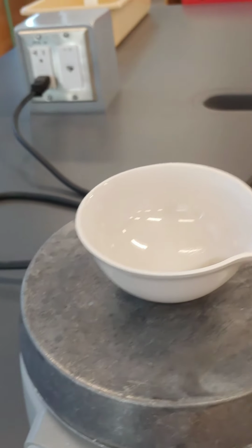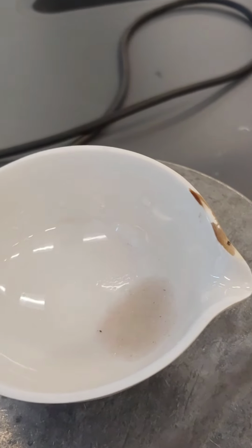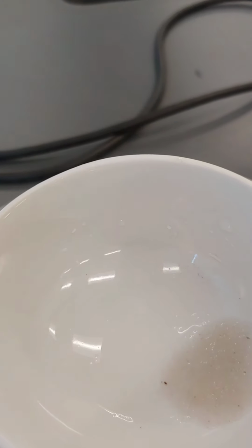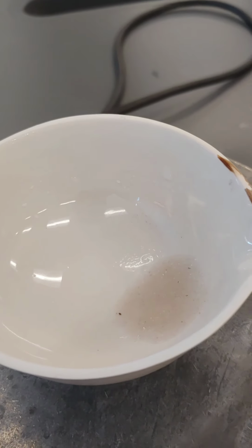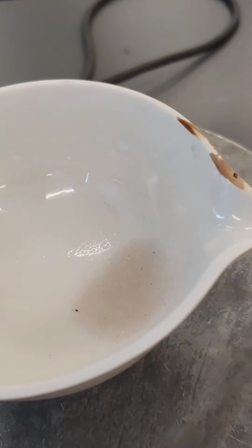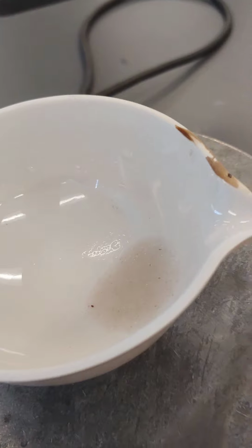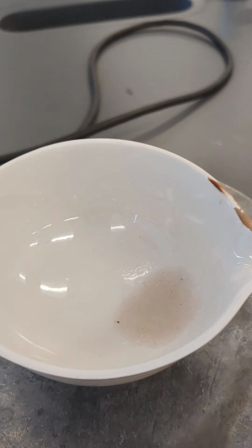So I'm at the point now where I have taken my sample that contained the salt and the sodium chloride, or the salt and the silicon dioxide, salt and sand, and I added water to the sand, rinsed it, poured it off, and I repeated that process 3 times, added a total of 45 milliliters of water. So now I have my first evaporating dish that has the wet sand in it.